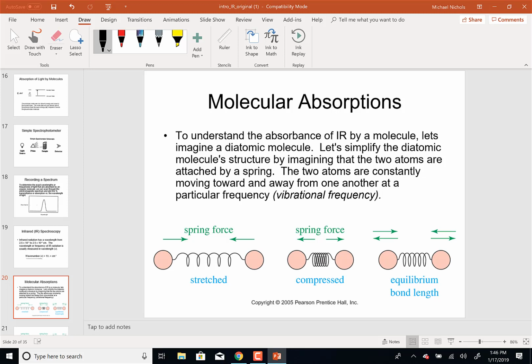When you pass the infrared radiation of that exact same frequency on the molecule, it absorbs the energy. They vibrate a little bit farther out, but at the same frequency, you go from ground state to excited state. So the frequencies have to match up, and that's a simple vibration, a simple bond stretching.